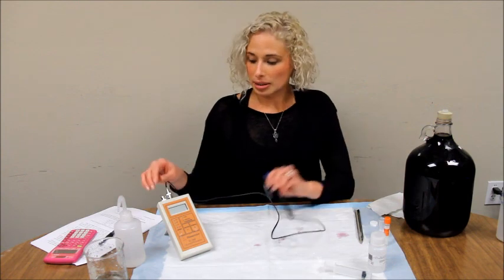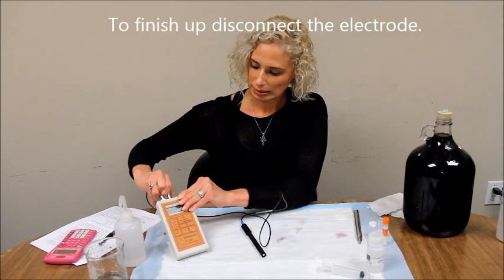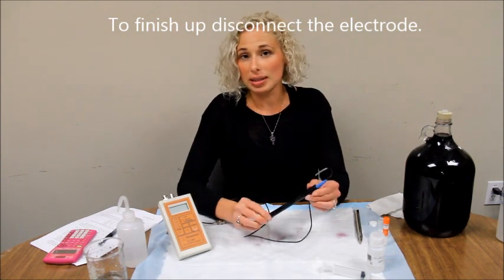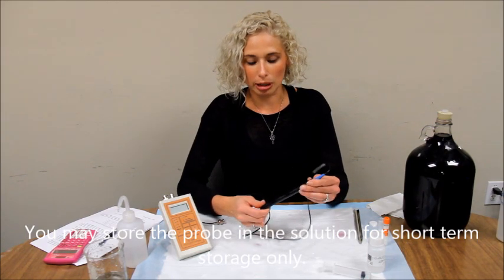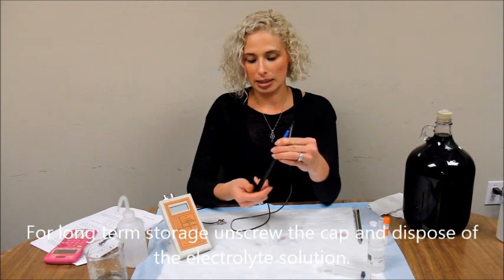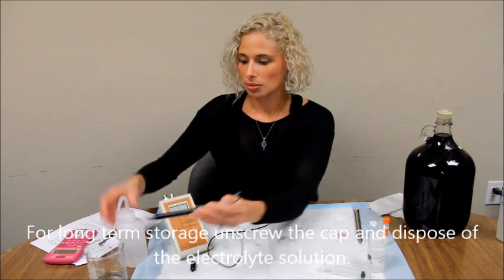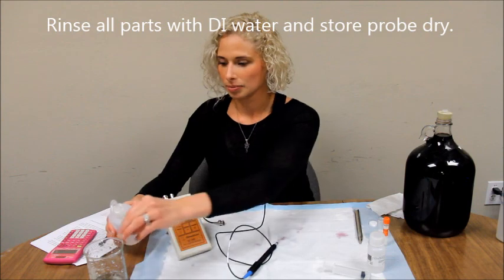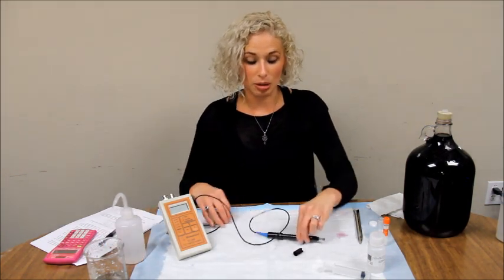Once you're done with the device, you can disconnect the electrode. You may store the probe with the electrolyte solution in it for short term. If you're going to do long-term storage, we recommend you unscrew the DO probe, dump the solution, rinse everything with DI water, and store the electrode dry.